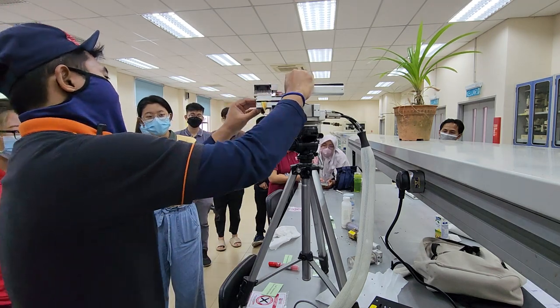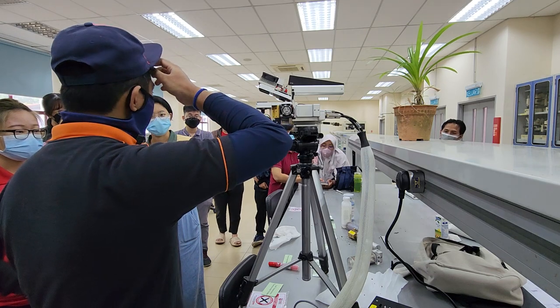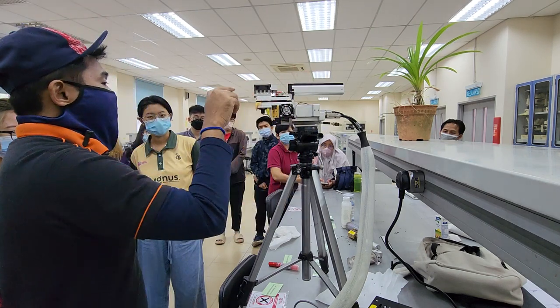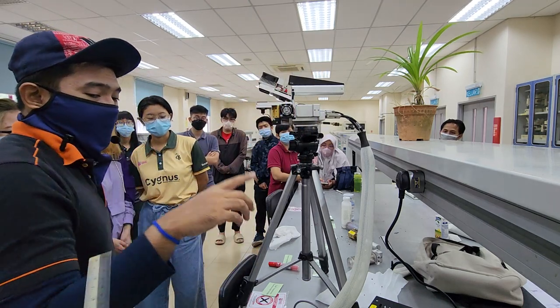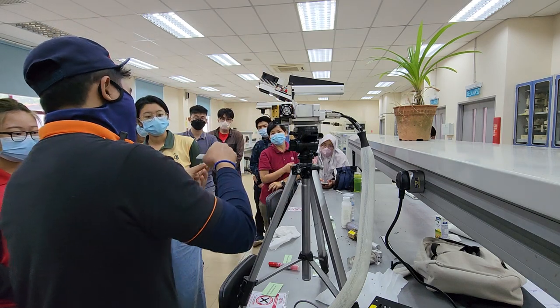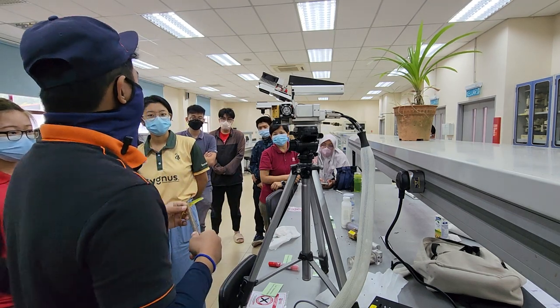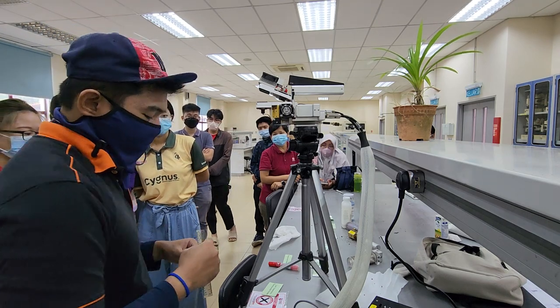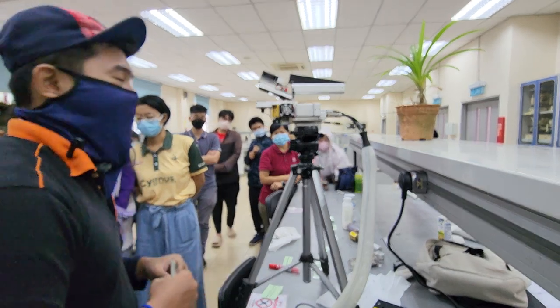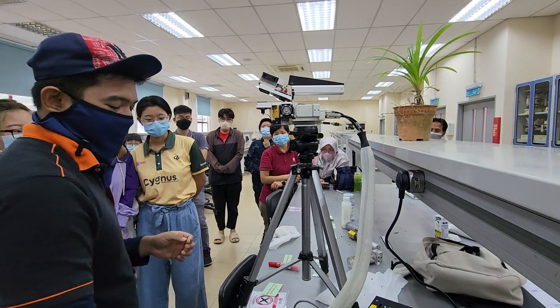This chamber here, this gasket here, this opening here is 2 by 3 centimeter, meaning 6 square centimeter. If your leaf is a bit smaller, it cannot occupy the 6 square centimeter. You need to calculate that using your ruler and then tell the machine. Like this one, for example, that's 3, no problem. But is it 2? That's not 2. That's 1.7 actually. So 3 times 1.7. What is it? 1.7, 3.4, 5.1. Is it 5.1? Yes. So 5.1. It's not 6 because this is smaller. All right? Okay.